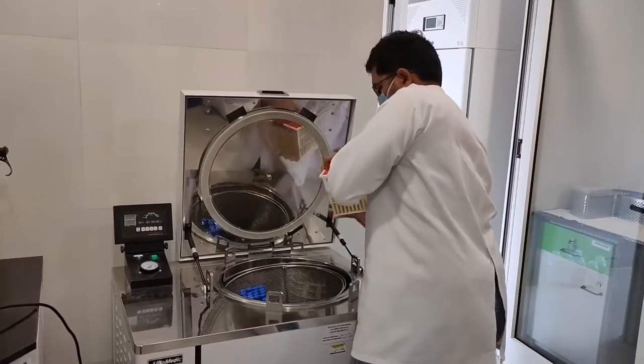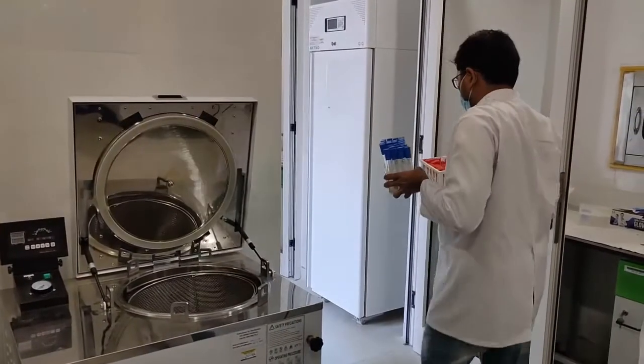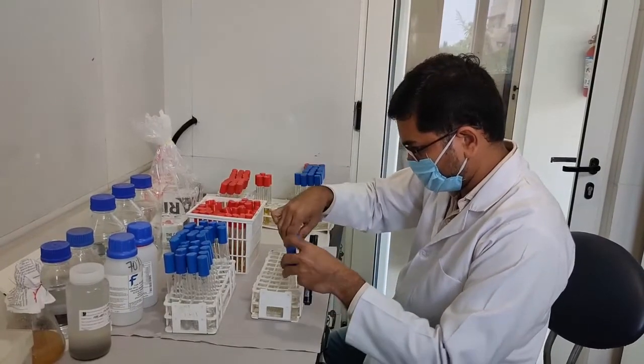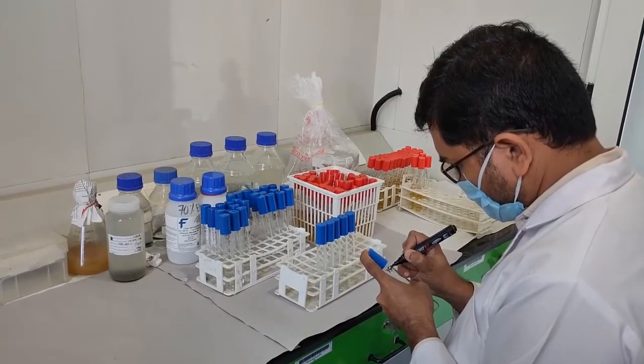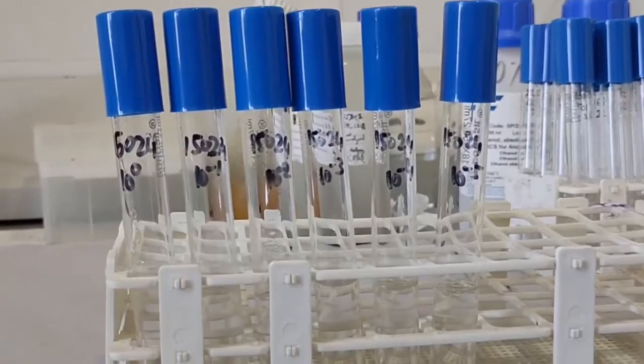After sterilization of reagents and glassware, depending on the sample to be tested, take the required number of tubes with sterile normal saline and place them serially in a test tube rack. Label them as 10⁻¹, 10⁻², 10⁻³, and so on, indicating the dilution factor.